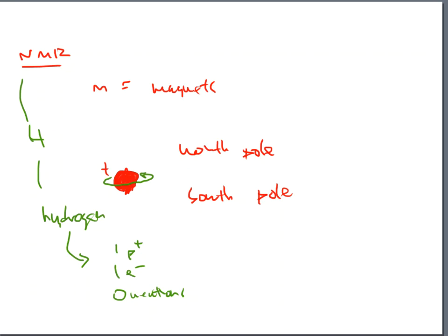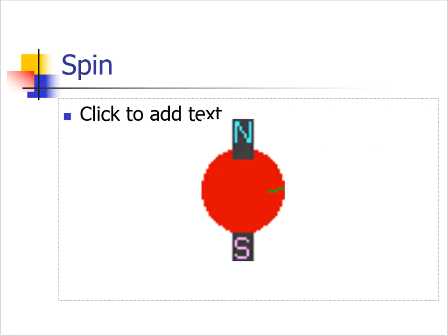And this NMR will be able to pick out what these atoms are doing because they are focused on the nucleus, and that nucleus has a constant rotation with a North Pole where Santa lives in Atomland and a South Pole. So this is kind of the basics of any science course. There's nothing maybe surprising here, except the idea that these things rotate, and maybe you've just never thought about that before.